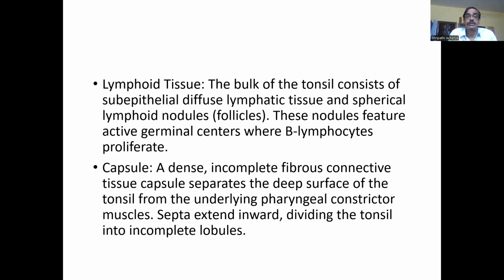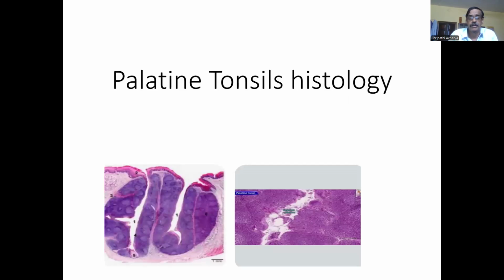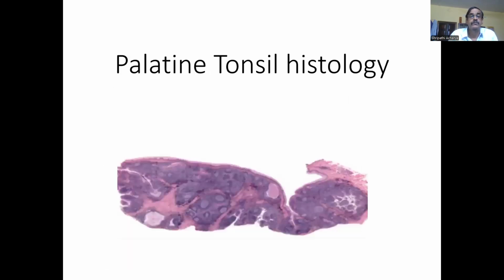Capsule, a dense, incomplete fibrous connective tissue. Capsule separates the deep surface of the tonsil from the underlying pharyngeal constrictor muscles. Septa extend inward, dividing the tonsil into incomplete lobules. Palatine tonsils.